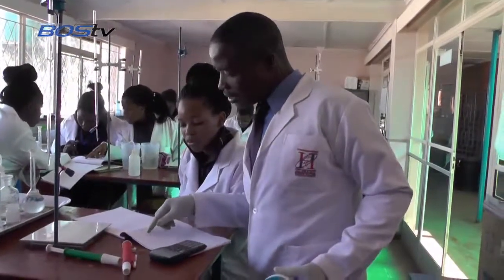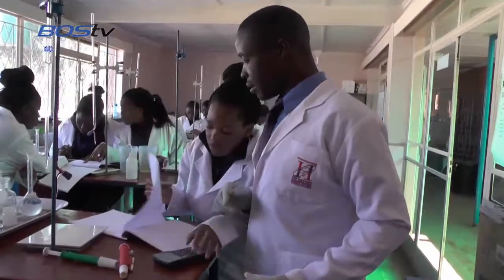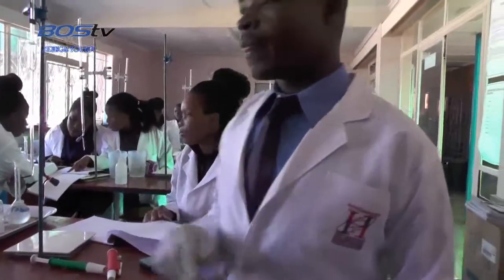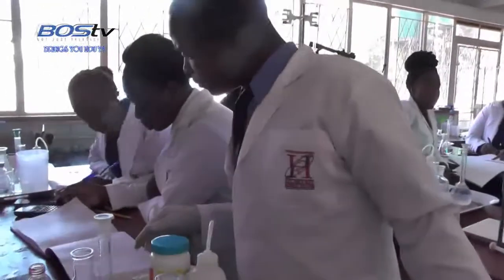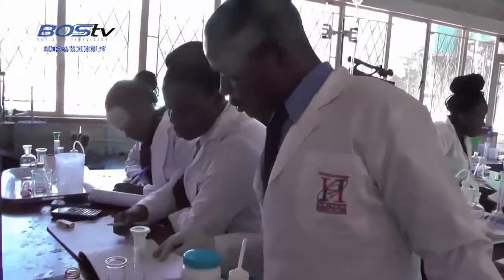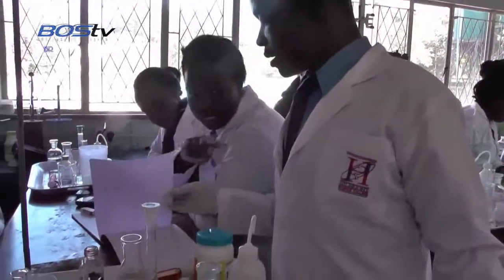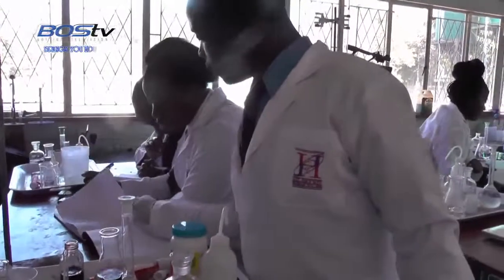This one is 0.02, not 0.2. Use a big volume which gives a value of it.